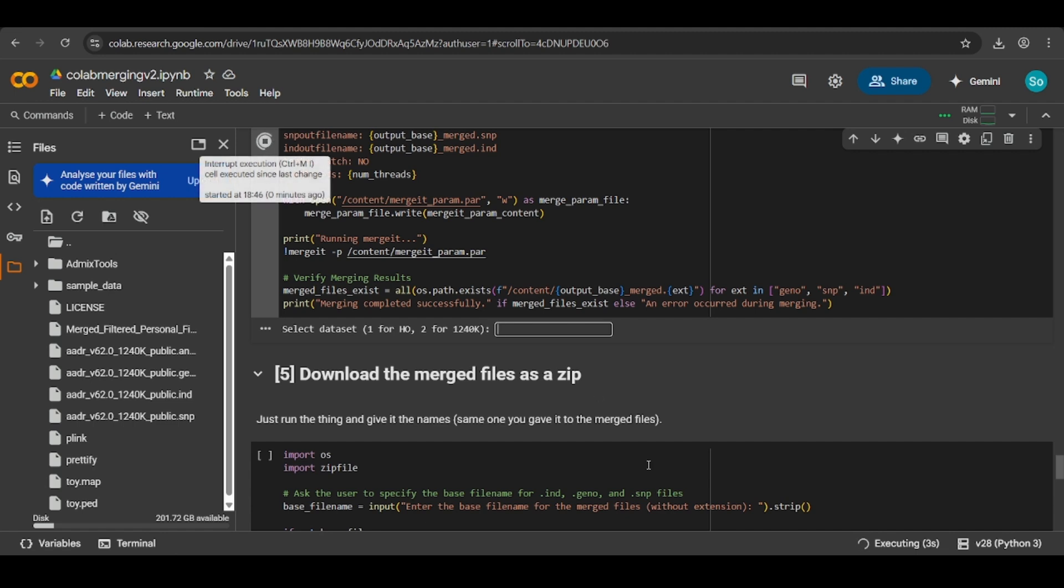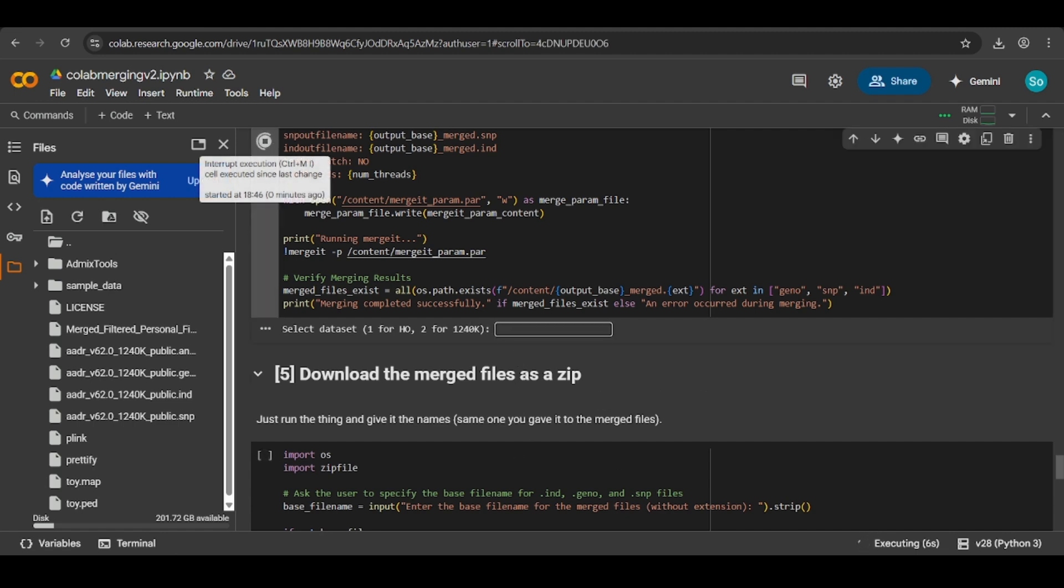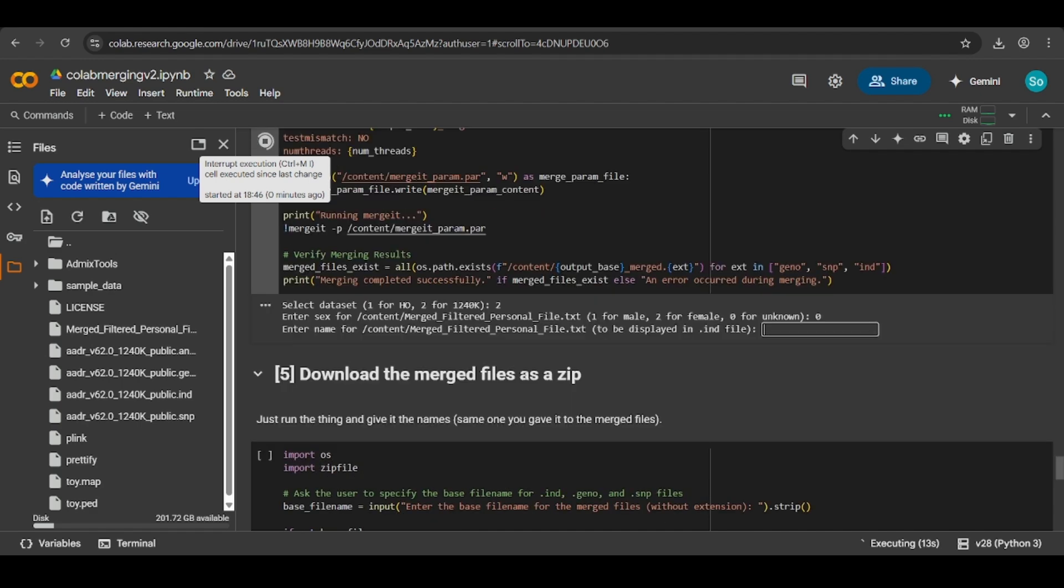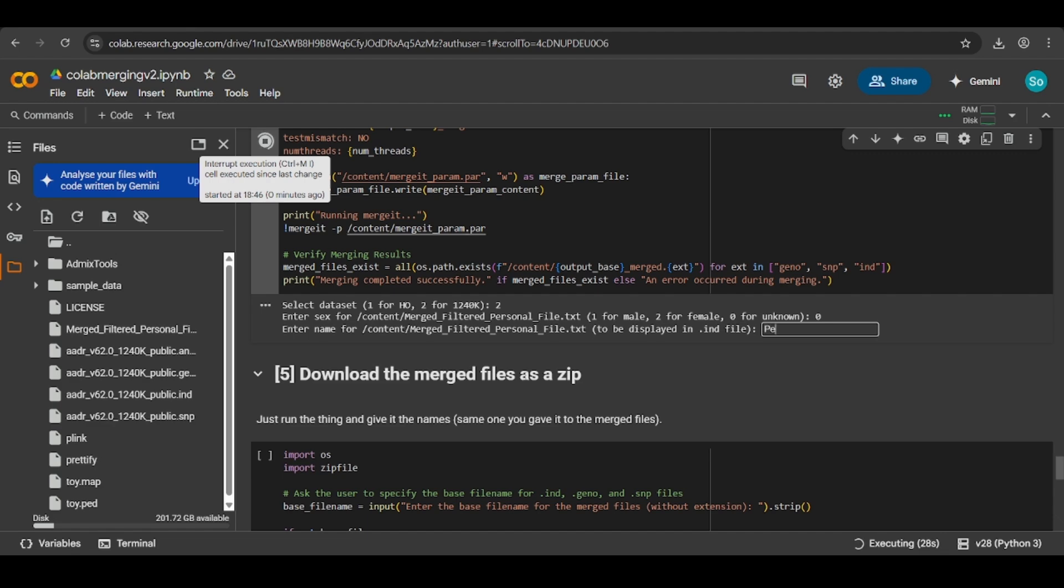The sex you don't really need to enter, it's not relevant, just enter zero. For the file, the name inside the IND file is going to be your target in qpAdm. Your raw file will be called this in qpAdm. It will be the target name. So here I'll just enter personal file.